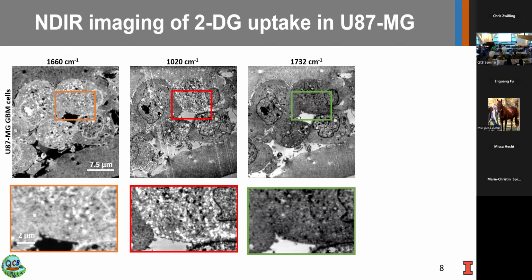And you see most of these regions going dark except for a few pixels here. There's still work to be done to make sure this is 100% glucose, because you obviously might have some other contributions from other factors in the cell. But based on the experimental workflow, the 1020 band should primarily give you glucose spectra.